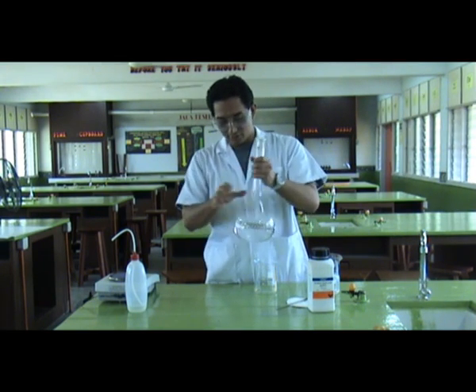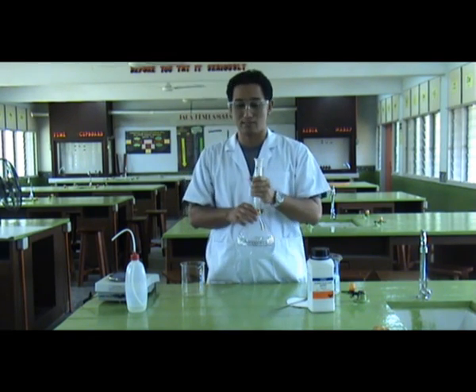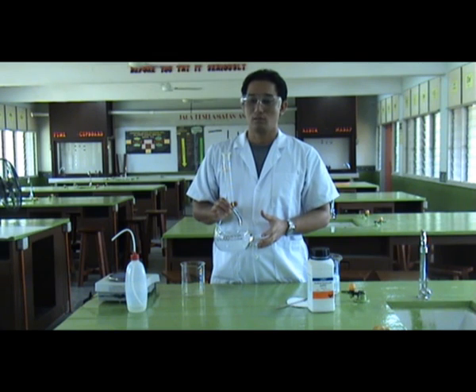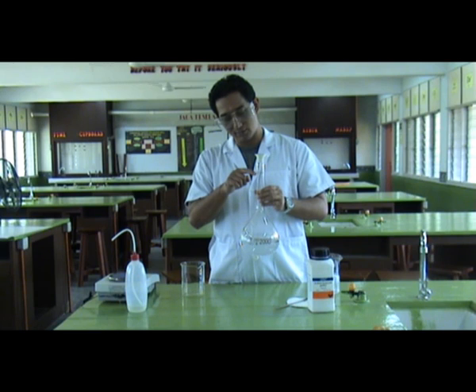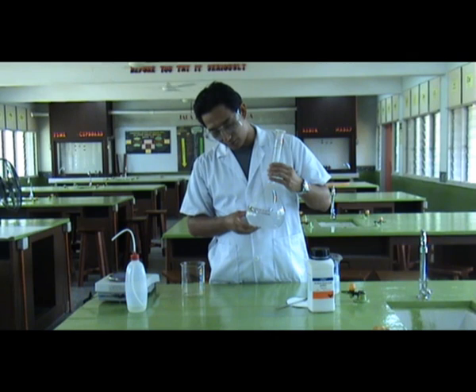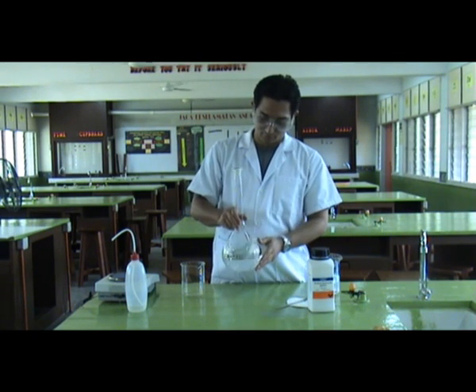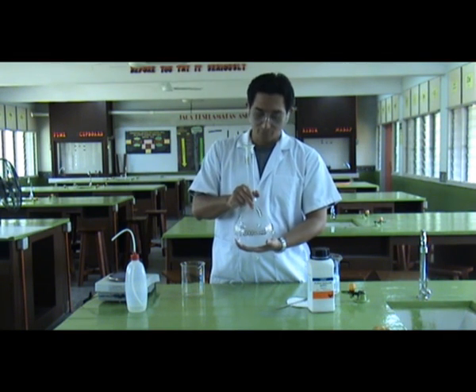For every solution that we prepare, we must use a volumetric flask. Because, for instance, if we want to make a volume of 2 litres, we measure to the line that shows the volume of the flask. You can still feel the heat from the reaction.